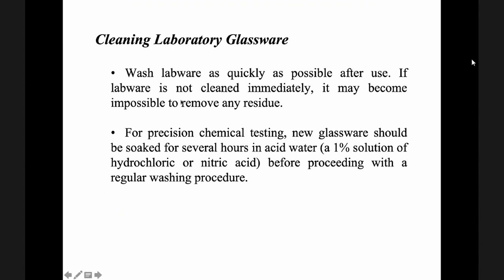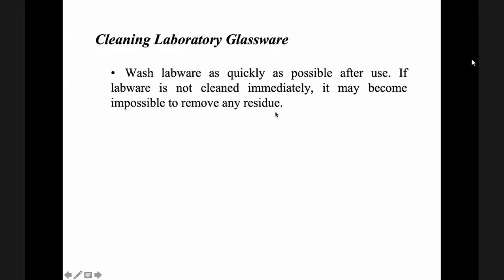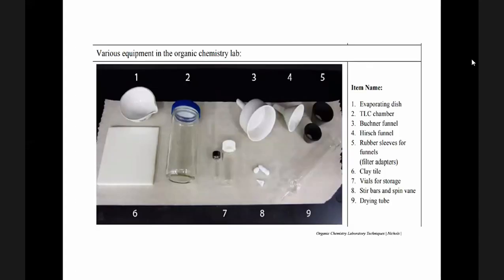Now, here, wash labware as quickly as possible after use. If labware is not cleaned immediately, it may become impossible to remove any residue, no, after using. So these are the different labwares used also in organic chemistry, no, analytical and organic chemistry.